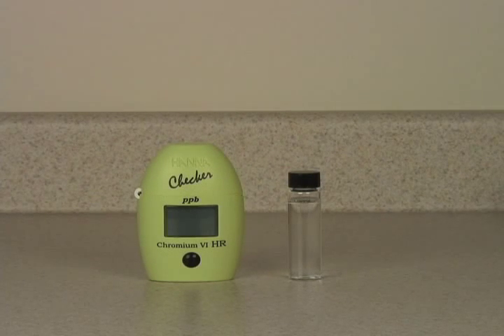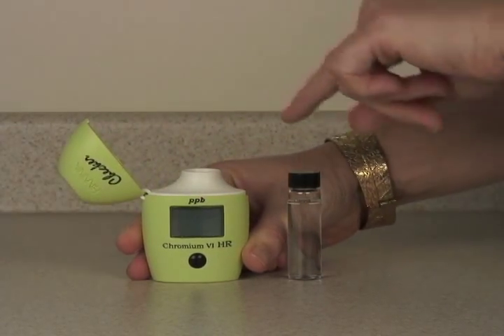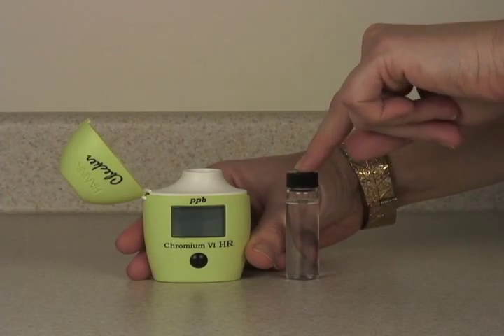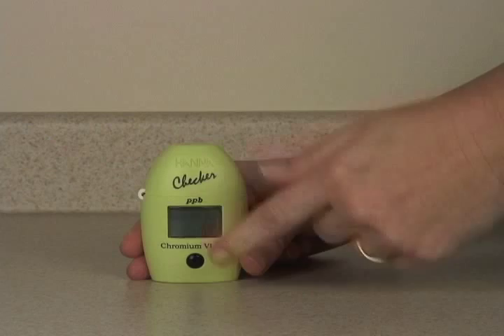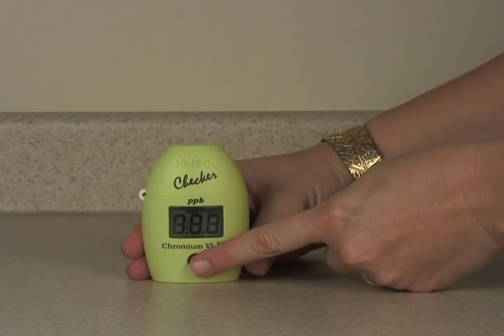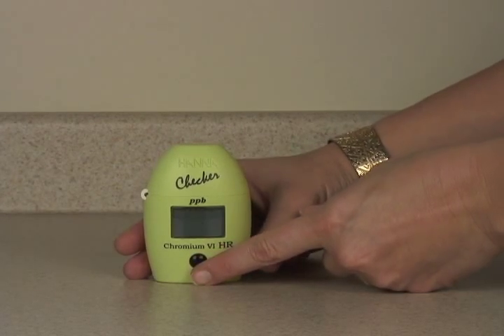Today we're going to test for Chromium-6 using the HI723 checker. We've got an unreacted sample of our local tap water, 10 milliliters in the vial. We'll put that in the meter, close the cap, turn it on, and press the button once to zero it.